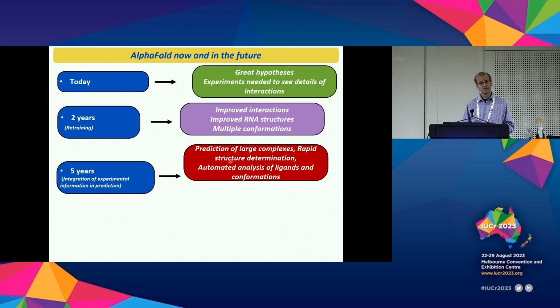5-year time frame, different story. In a 5-year time frame, we should be able to integrate the experiment with the prediction. So instead of running our software to solve a structure and running AlphaFold to do the prediction, those should be one thing, right? You should be feeding your data into some software, and it's going to do prediction, and it's going to do analysis of the structure.